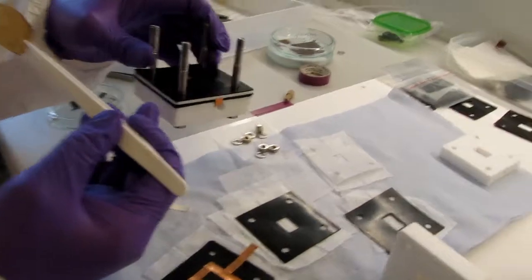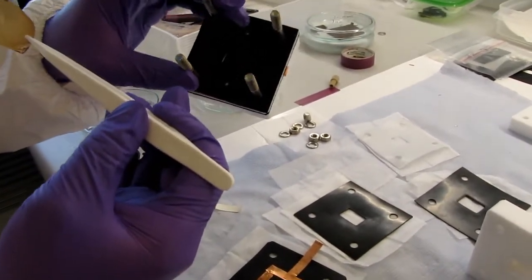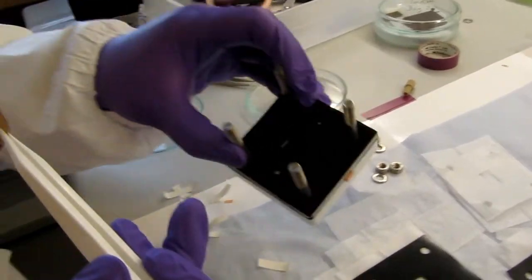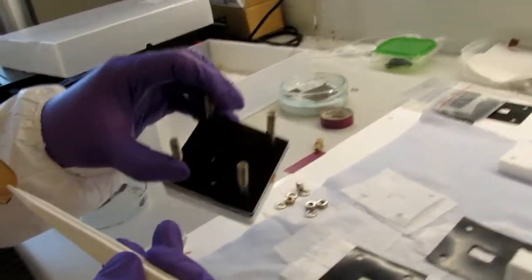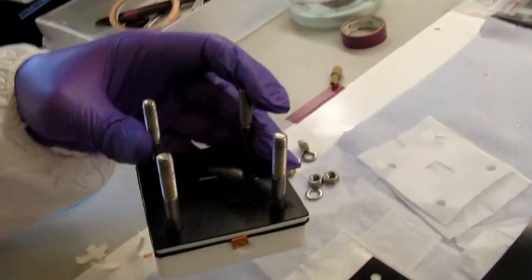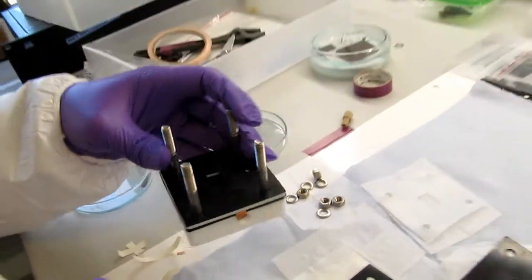This side is actually a counter electrode, iridium oxide coated on GDE. So the black one inside is the iridium oxide. You turn it to the light a little bit, maybe. It's not very good, right? Yeah, it's not easy to see.